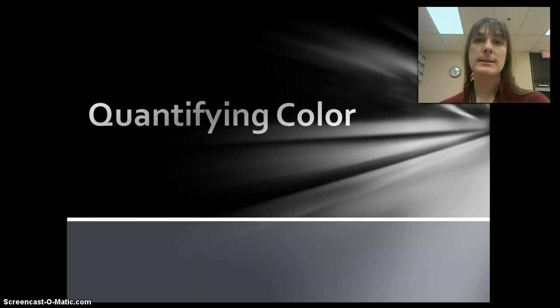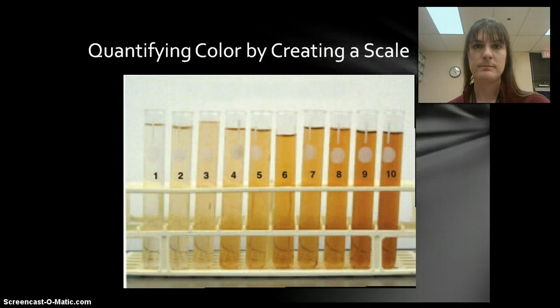A good example is with the enzyme experiment, where we use guaiacol as an indicator for oxygen, because guaiacol reacts with oxygen, and when they react, it forms this dark brown color. The darker brown, the more oxygen, and that can tell us a little something about the system.